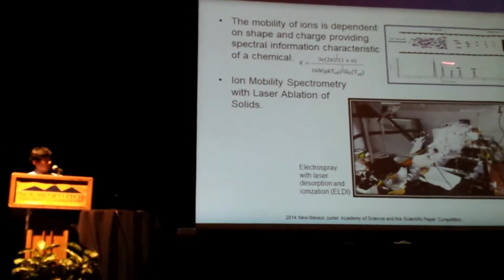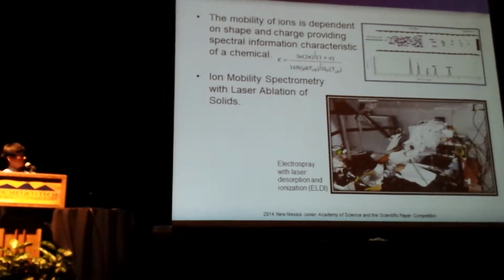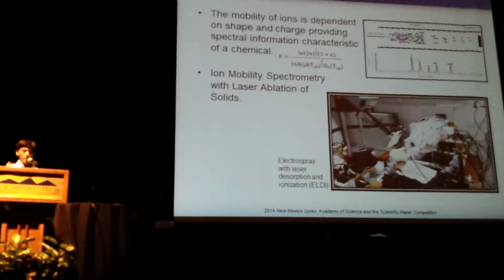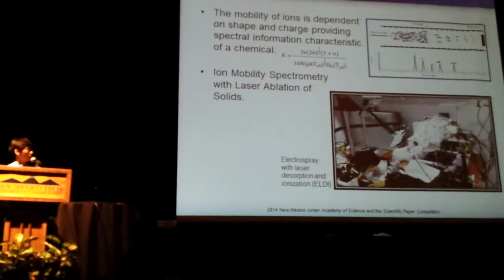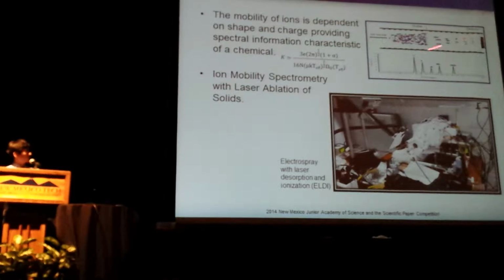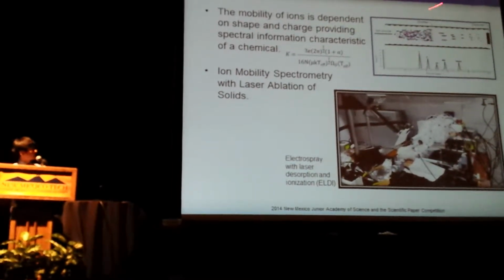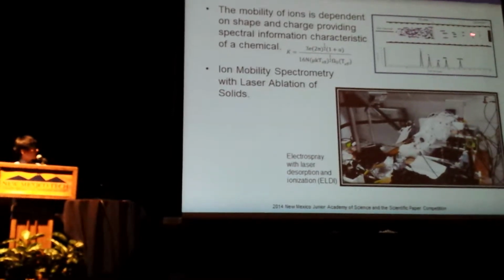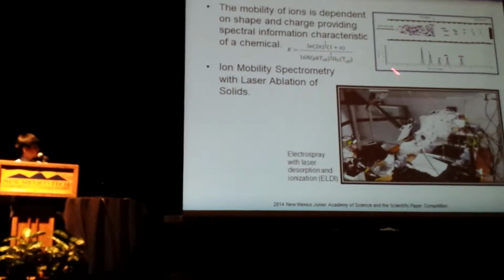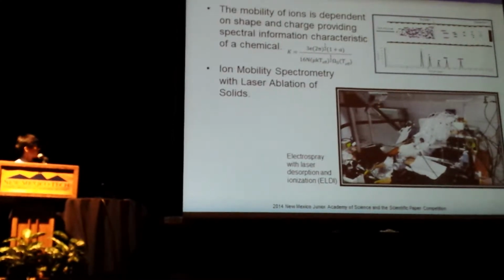This is the apparatus called the drift tube, and there's an ion source here that sends a plume of ions into the drift tube, which is stopped by the shutter. The shutter turns on and off. When the shutter does turn on, all these ions race towards the detector. Of course, some of the ions travel faster than others, and the drift time down here is the time between the ions being released and the ions being detected over here. The intensity, shown by the y-axis here, is the amount of these ions hitting the detector at that time.